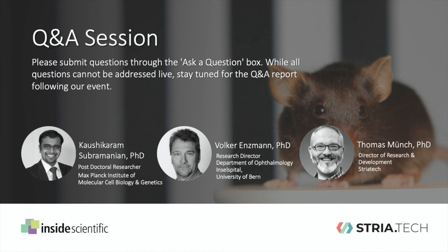Okay. And actually, in the interest of time, we are going to make this question our last question. How do you make sure the animal stays on the platform? Thomas, maybe you can start, and then I might ask for some feedback also from Kaushik and Volker. Well, interestingly enough, animals usually do stay on the platform, but there are certain factors that support this. First, if an animal is well handled, it is much calmer and is way more likely not to be jumpy and thereby jumping off the platform.